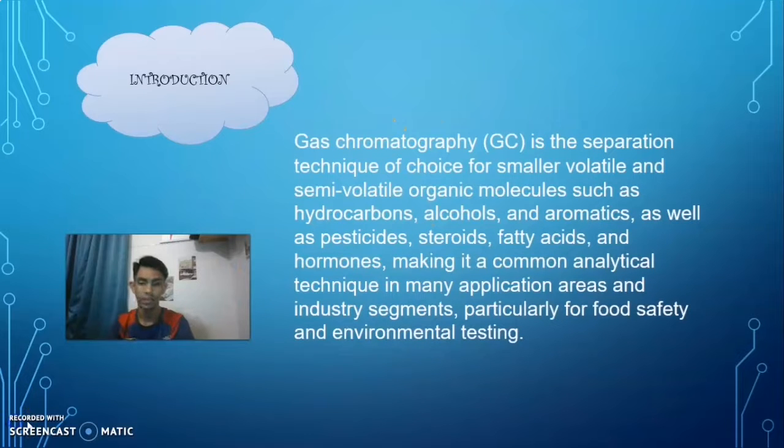So let's start with the introduction. Gas chromatography is the separation technique of choice for smaller volatile and semi-volatile organic molecules such as hydrocarbons, alcohols, and aromatics, as well as pesticides, steroids, fatty acids, and hormones, making it a common analytical technique in many application areas and industry segments, particularly for food safety and environmental testing.